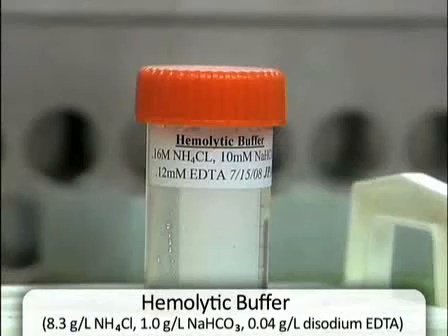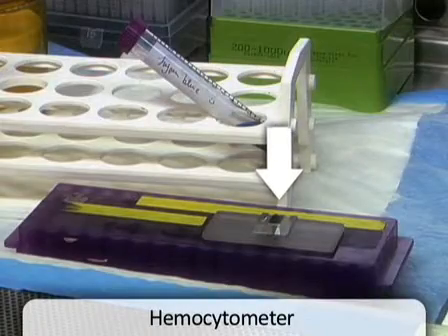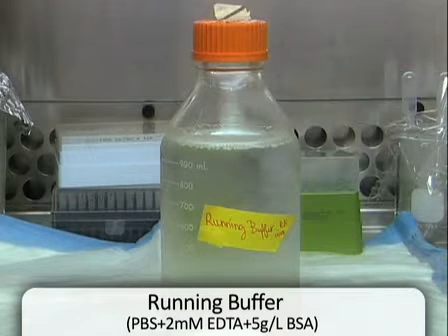Hemolytic buffer containing 8.3 grams per liter ammonium chloride, 1.0 grams per liter sodium bicarbonate, 0.04 grams per liter disodium EDTA. Trypan Blue, 0.2% solution in PBS. Hemocytometer. 15 milliliter conical tube. Running buffer containing PBS supplemented with 2 millimolar EDTA plus 5 grams per liter BSA.